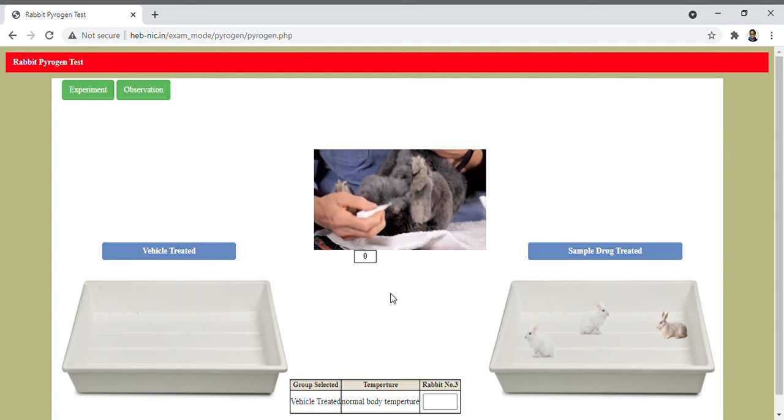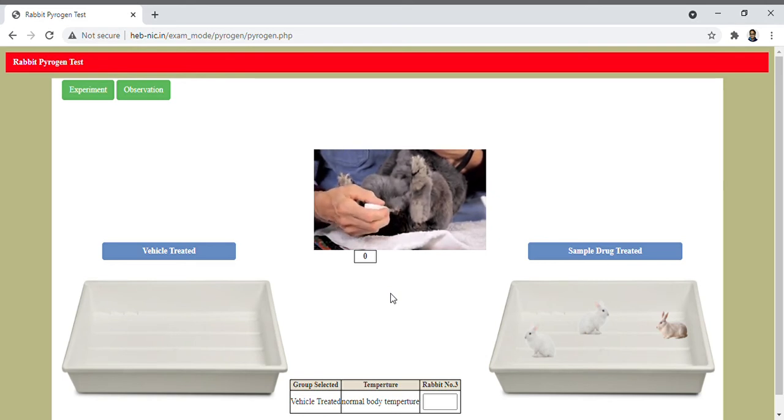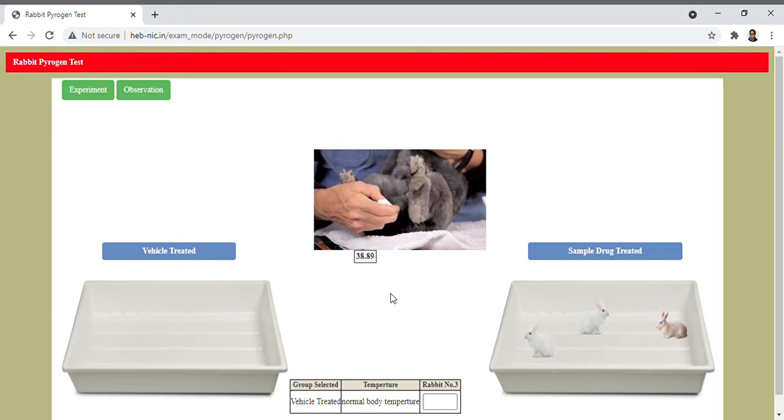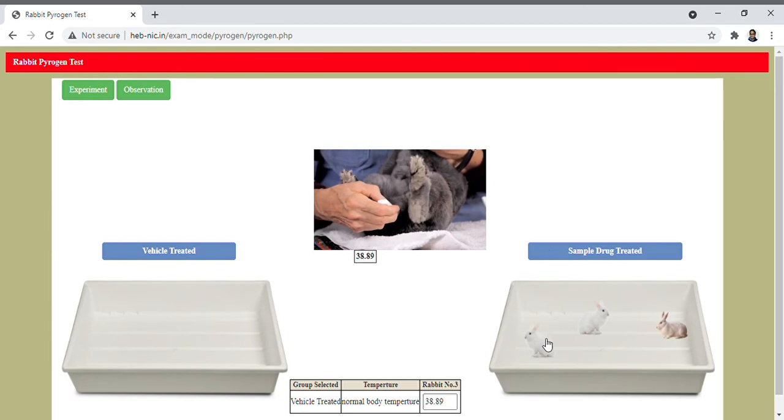Take the thermometer and insert into the rectum and record the temperature, and it is 38.89. Now repeat the same procedure to record the temperature in the sample treated group.